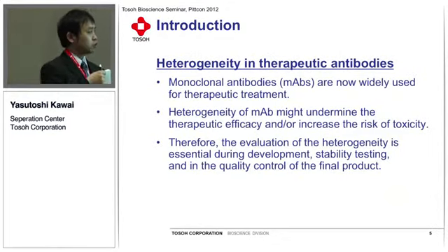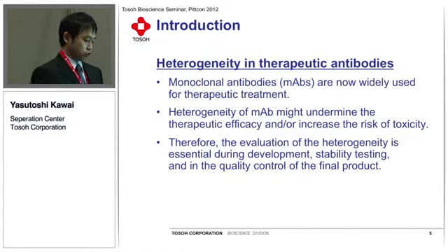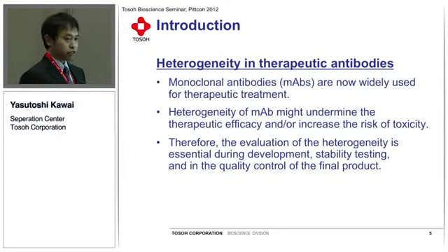Monoclonal antibodies are now widely used for therapeutic treatment because they are expected to be more effective and less harmful than traditional chemotherapy.